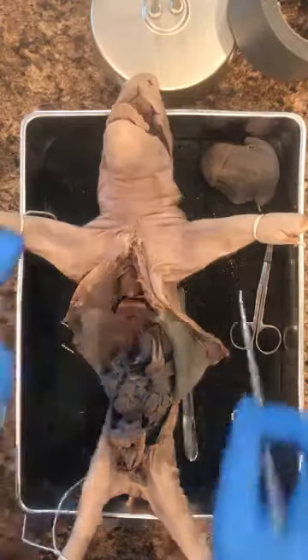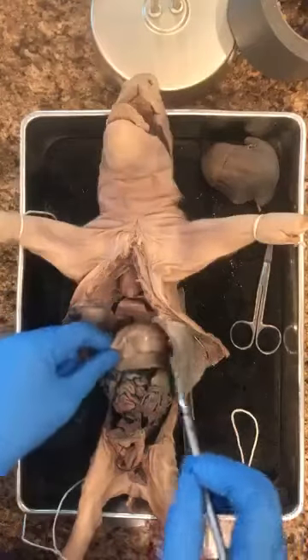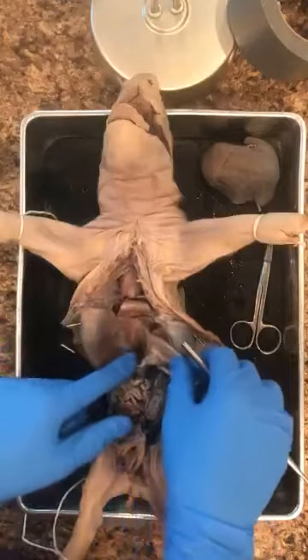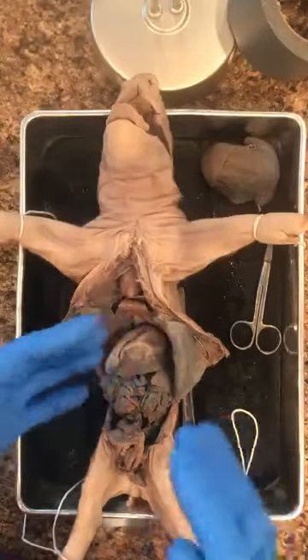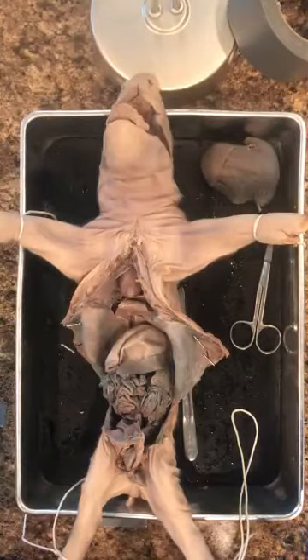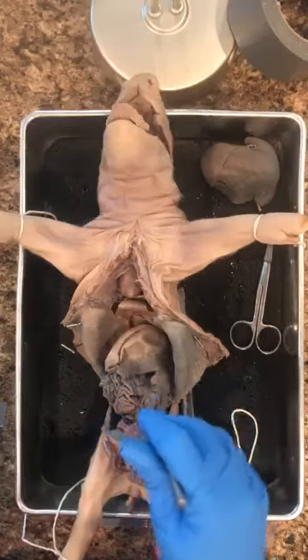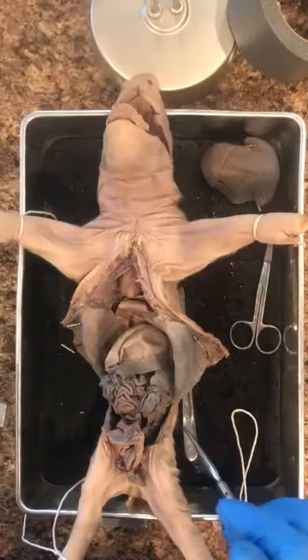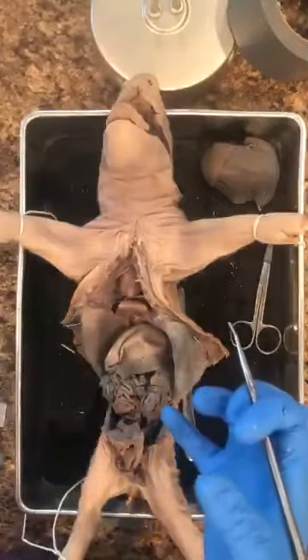Okay, on the left of the pig, not my left, not your left, the pig's left, is the stomach. So the stomach is right here. It is brownish, pinkish in color. It is like a sack, like a big flappy bag kind of thing. And its purpose is to break down the chunks of food using hydrochloric acid and muscle contractions. If we were to open this up, we're not doing that right now, you would still see those rugae or those folds because it's going to increase surface area, and it's also going to help with the muscular contractions.